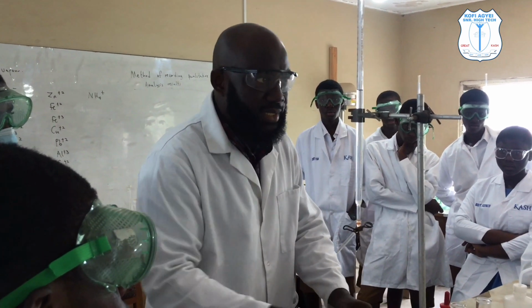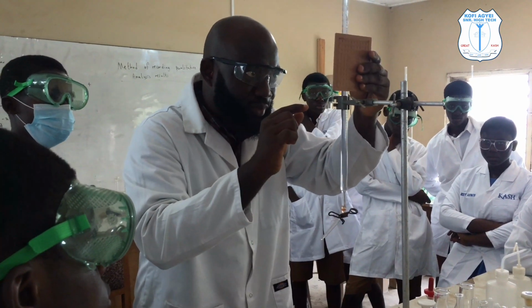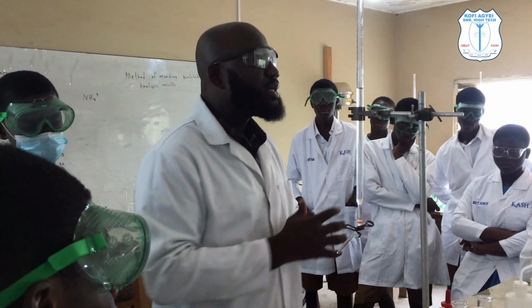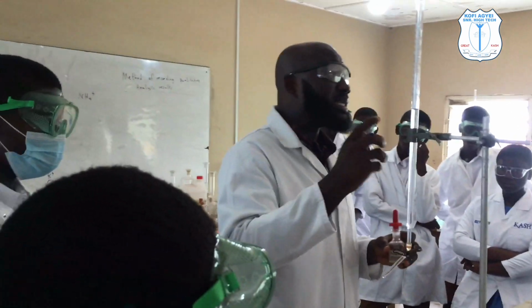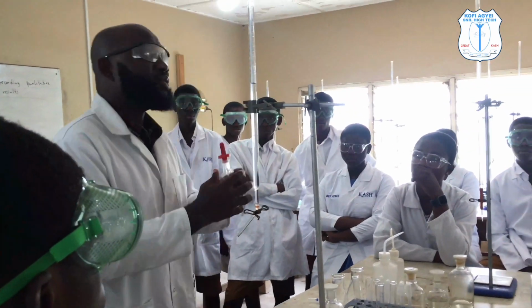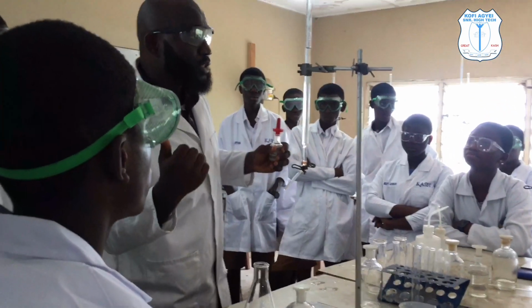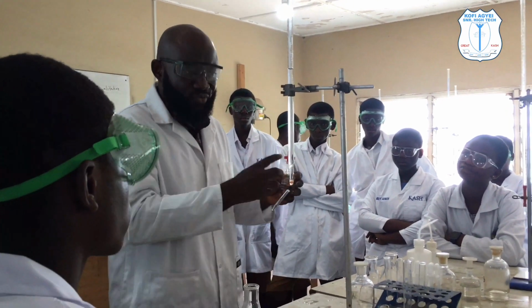Then you take your reading nicely. Like I said, if you can't see the calibration properly, you apply your white tile. 31.50. So when you use the phenolphthalein and the methyl orange, you are likely to get the same or tighter values. Do you get it? If not the same, sometimes the difference is not quite that huge. So the first one we have 32.20, and here we have 31.50. So the difference is not quite that huge.